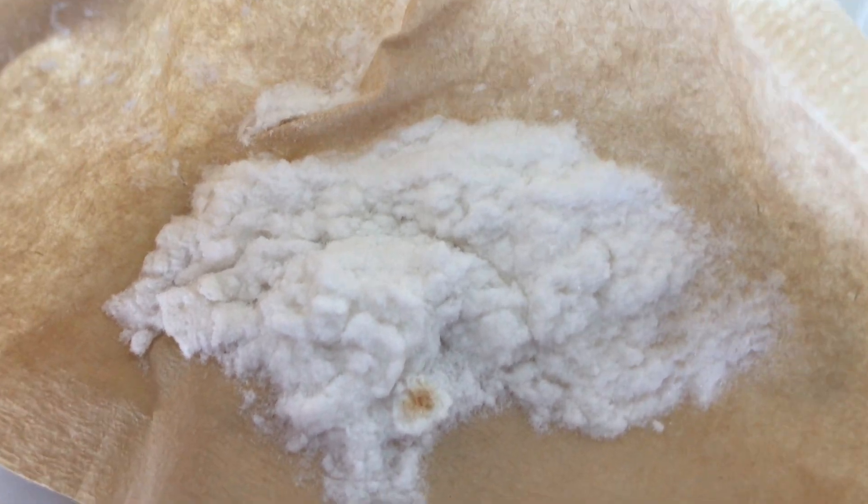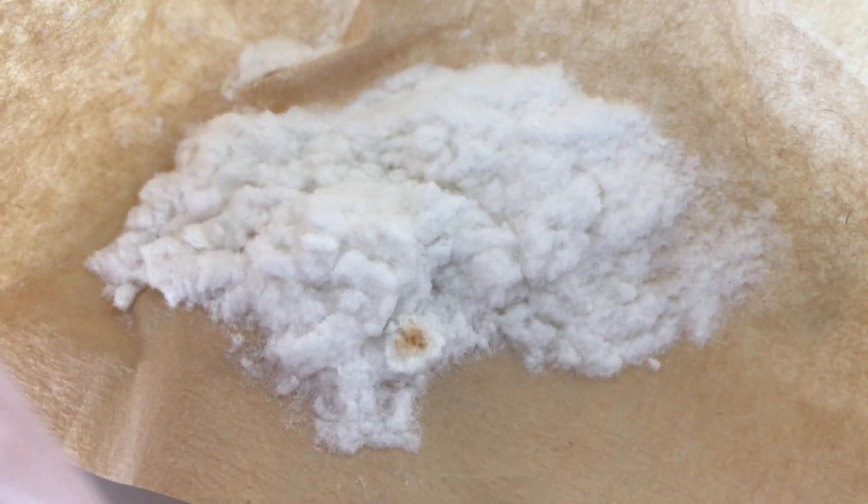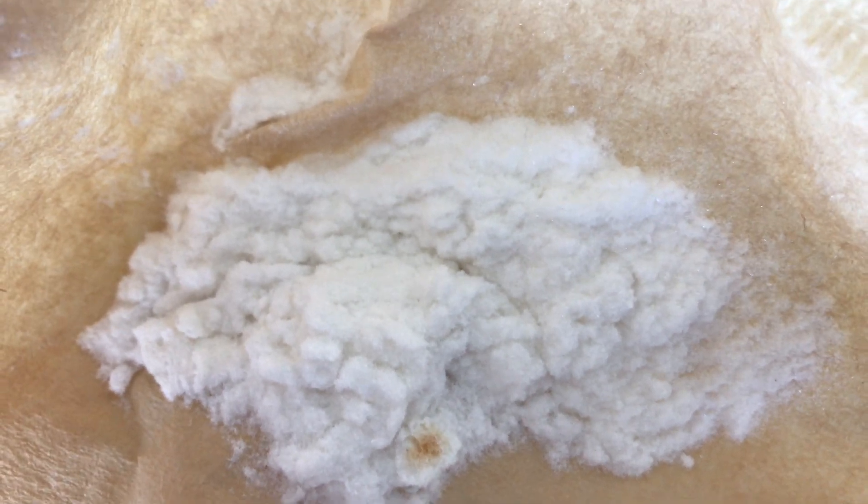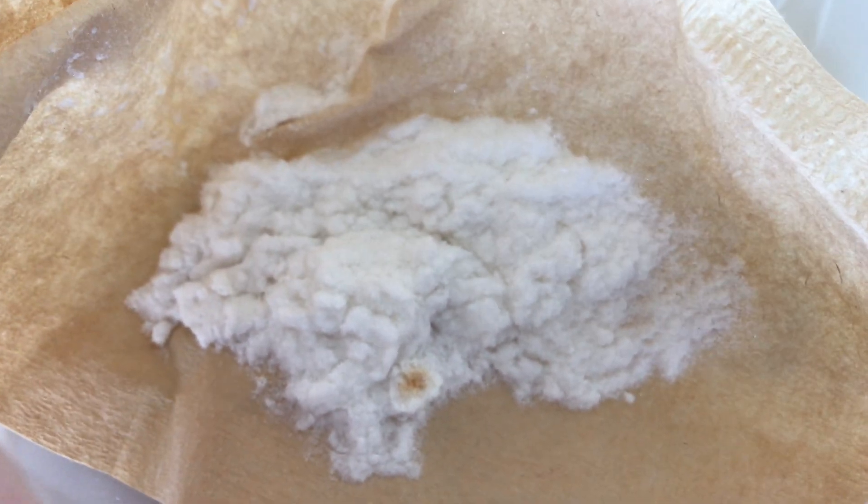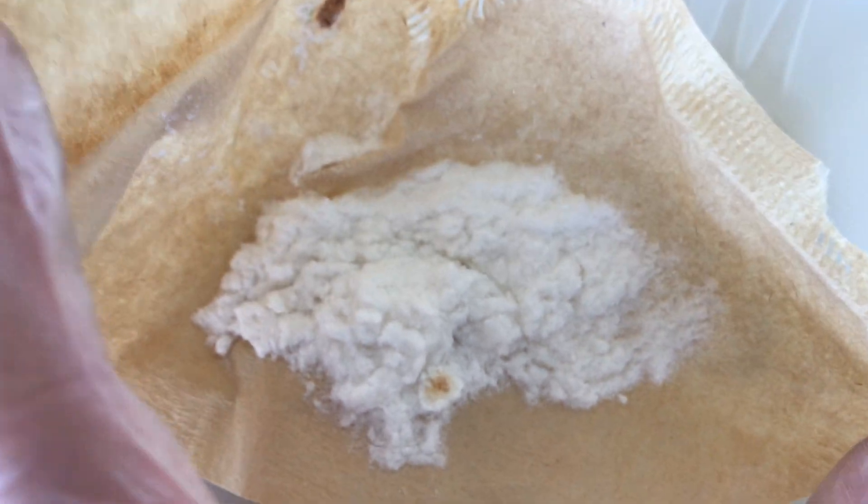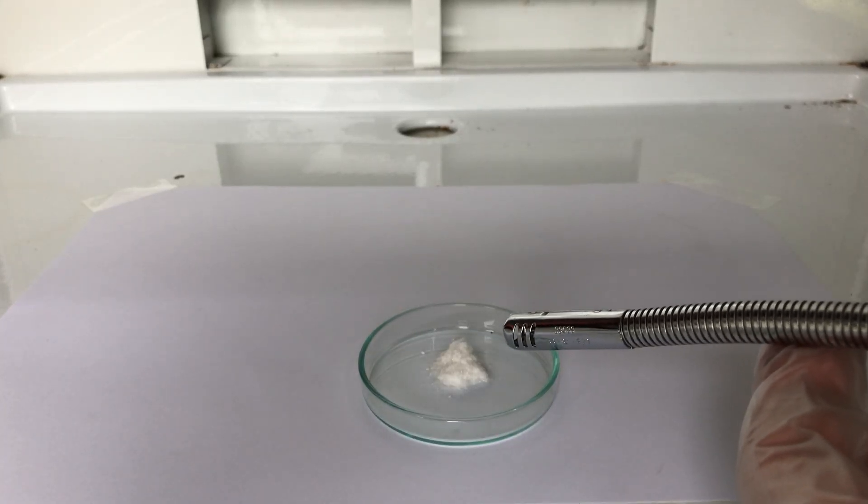This is mercury thiocyanate. It is a white, highly toxic mercury salt. When lit up, it reveals an interesting property. It produces a snake that can kill you without having to bite you.